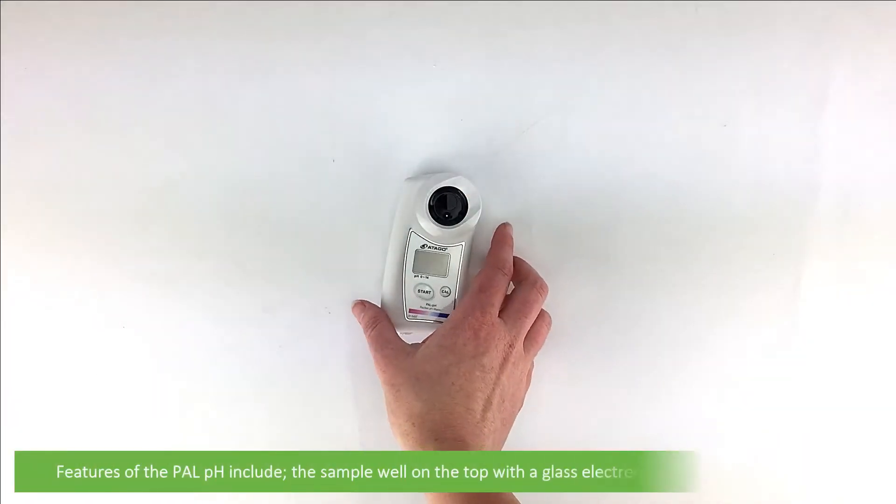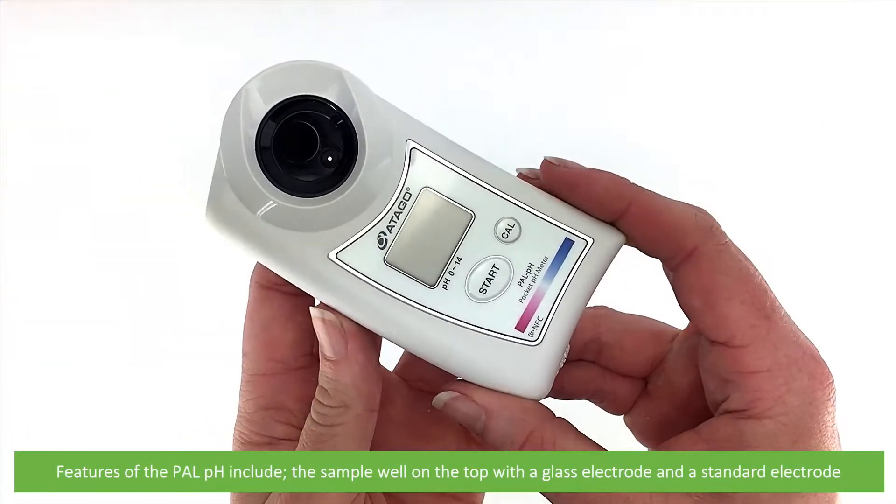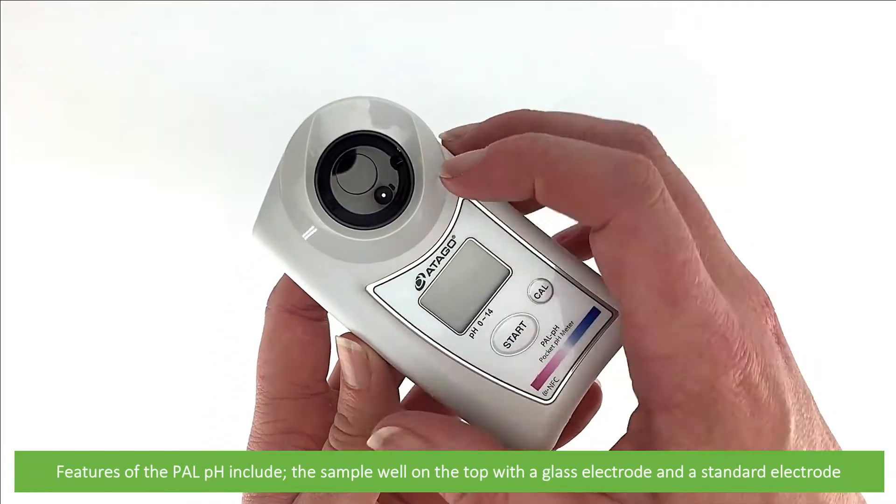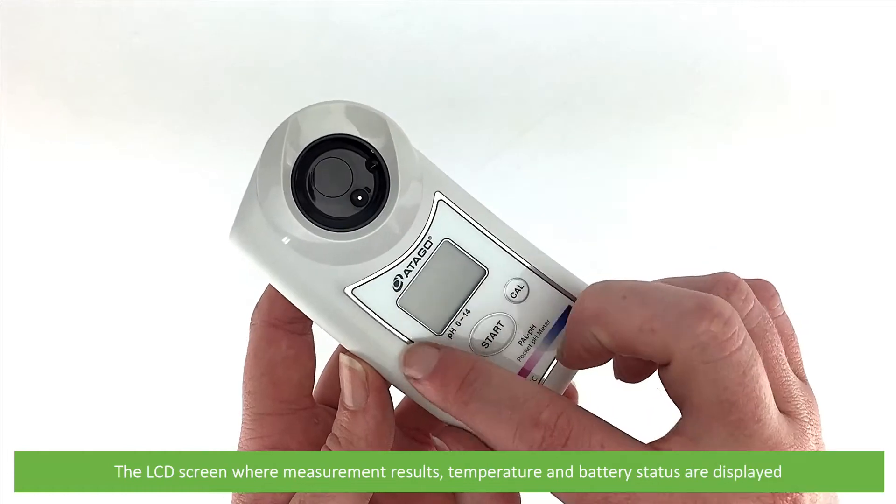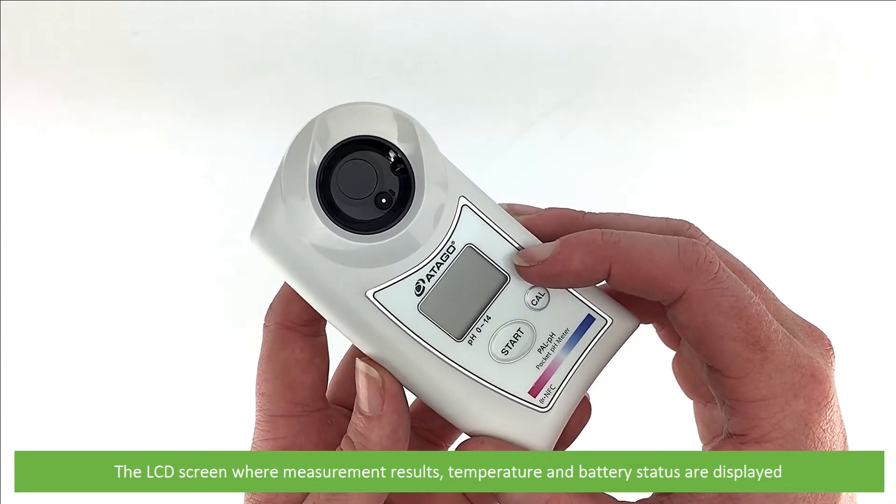Features of the PAL PH include the sample well on the top with a glass electrode and reference electrode, the LCD screen where measurement results, temperature, and battery status are all displayed.